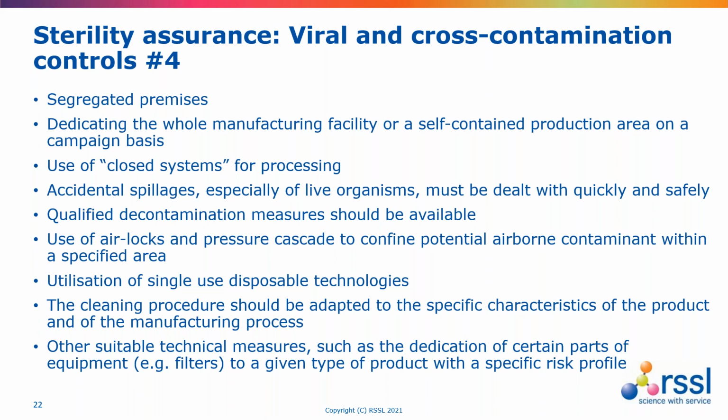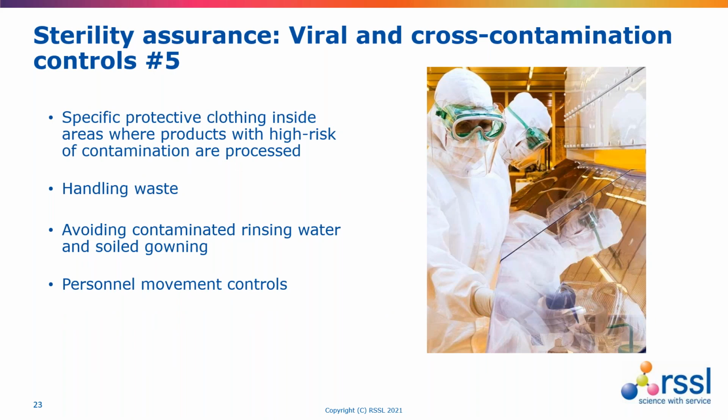There should be documented and assessed cleaning and decontamination steps between every batch, and this might vary, going back to that campaign thing, to be at different levels, but it certainly needs to be something thorough in place. And other suitable technical measures need to be considered, so like dedicated filters and so on.